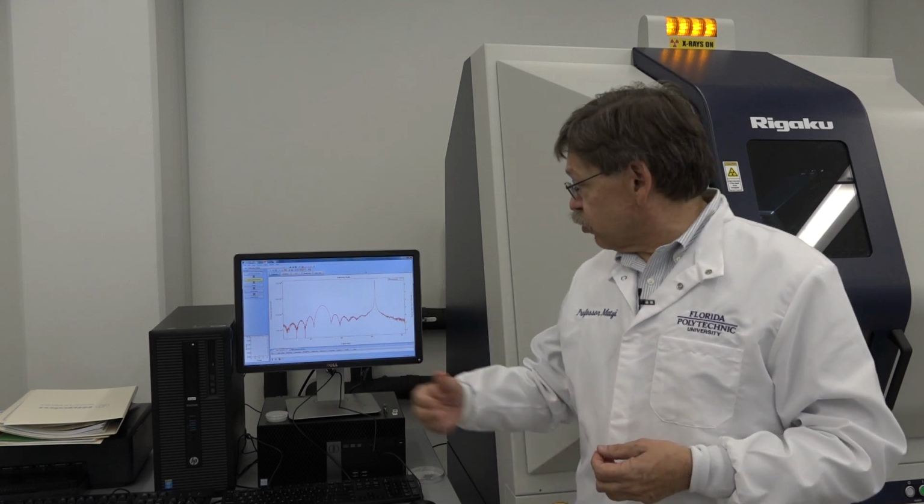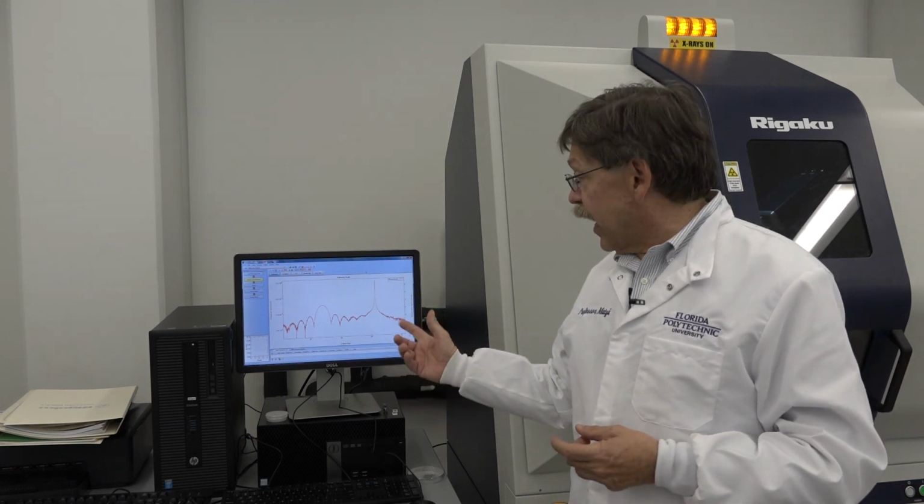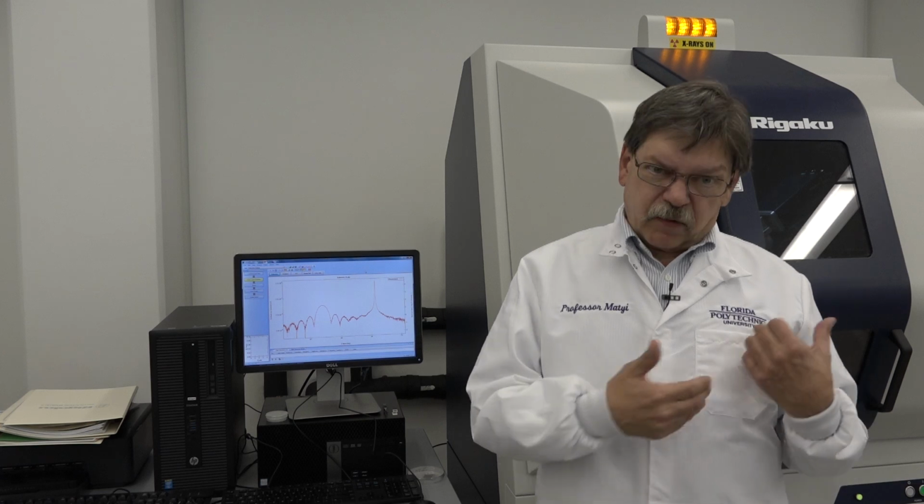As an example of this, right here behind me is an example of one intern's work. This is a high-resolution double-axis rocking curve, a very common analytical technique in the semiconductor industry. We are doing it here. So what is happening is that all of these interns are going to learn, of course, a fair amount of X-ray diffraction theory and practice, but in addition, they are going to learn what it takes to effectively operate a major piece of instrumentation in a research and development environment.